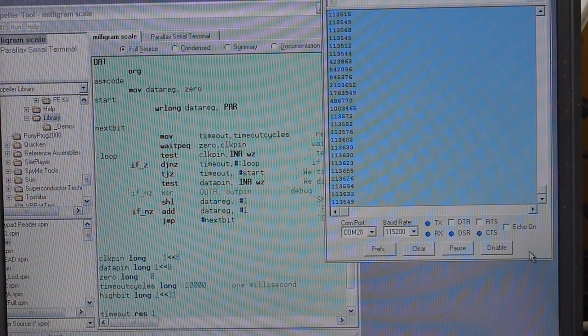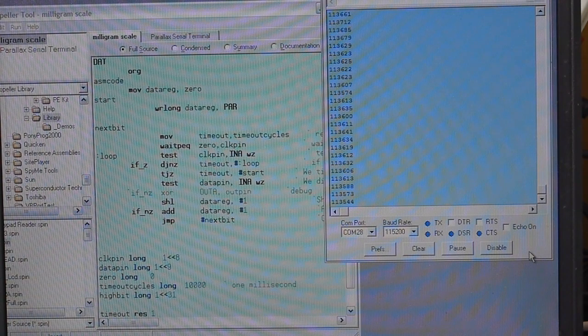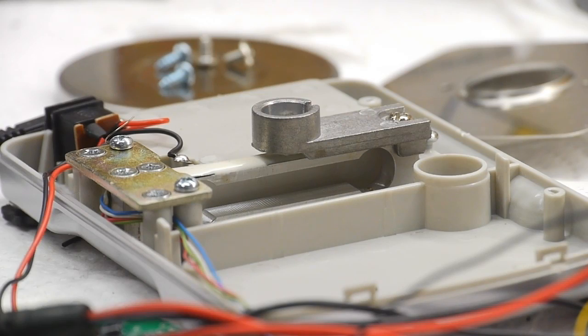Since I've come this far with the Propeller, I'll probably just do the whole project using this chip. It's been a while since I've used it and it has some cool features. Since each core runs at 80 MHz, it's possible to do video generation without too much work, and your program can just send values to the core doing video generation without adding much overhead.